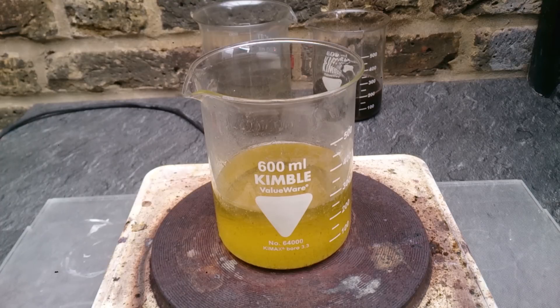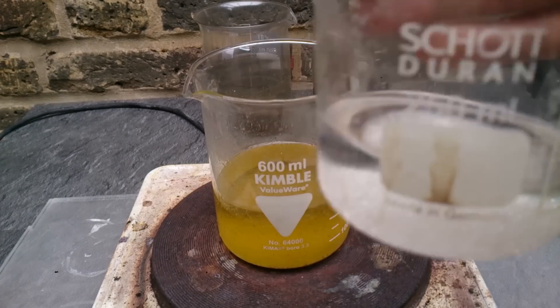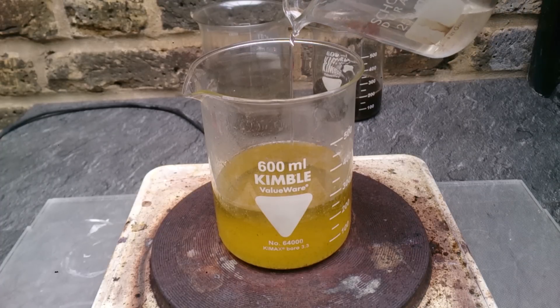The first thing you will do is neutralize any nitric acid. Probably the quickest and easiest way is to use sulfamic acid — just add it until there are no more bubbles. That's it, that's all it takes.